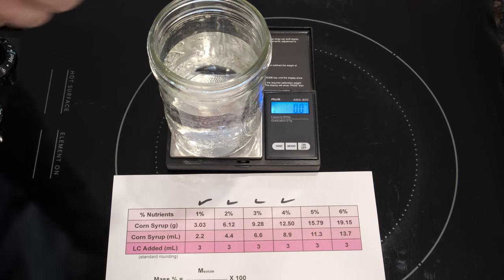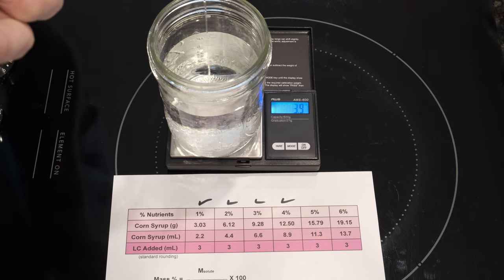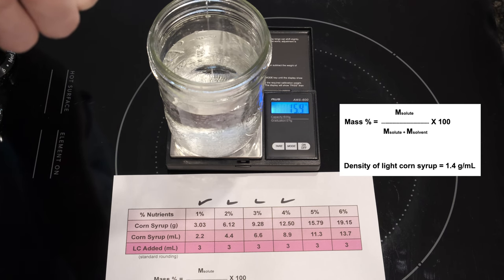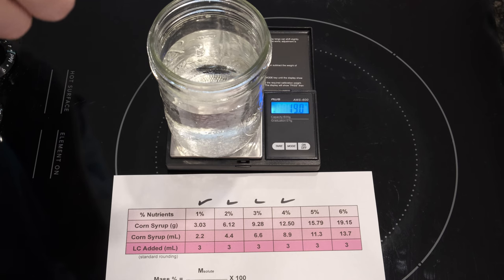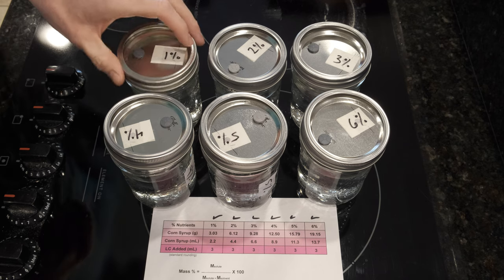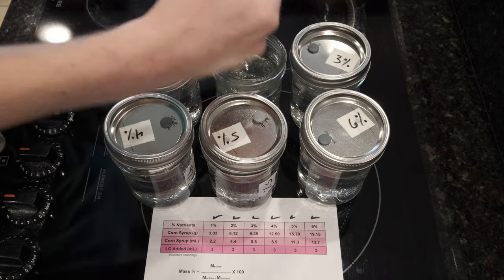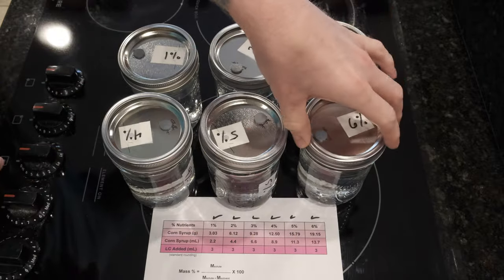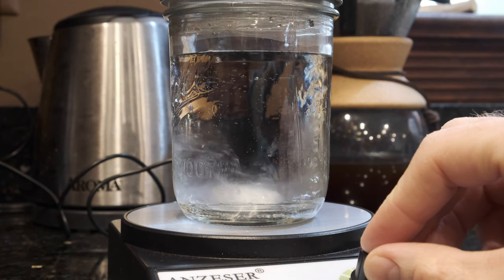Next I added a pre-calculated amount of corn syrup — you can see my table there where I've calculated everything out. Then I added a magnetic stir bar to each of the jars.